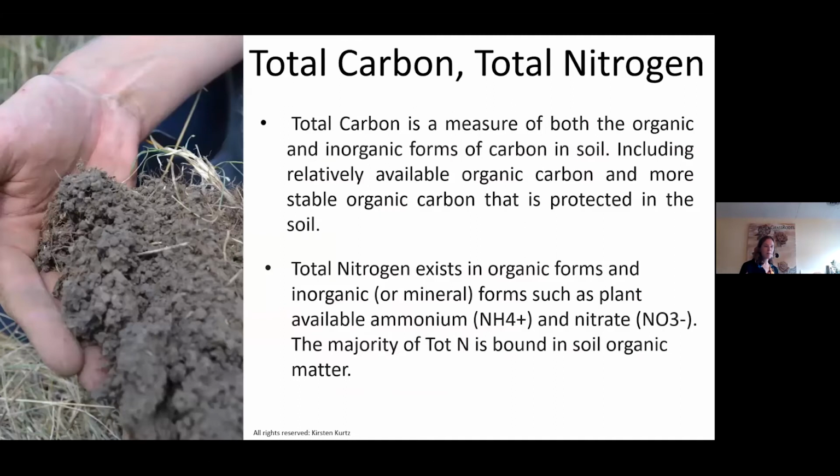We also, as I mentioned, have just started looking at total carbon and total nitrogen. This is obviously extremely important. When we're talking about total carbon here, we're talking about the organic and the inorganic forms of carbon. So earlier when I was talking about active carbon, that's just this part of it. This is everything. We're really trying to get at that total number. And we're also looking at that total nitrogen number, right? This is, again, extremely important, not only for the carbon nitrogen ratio, but just in general to understand the functioning and potential of your soil.